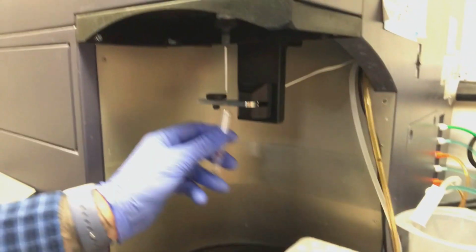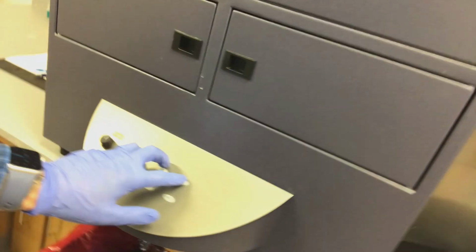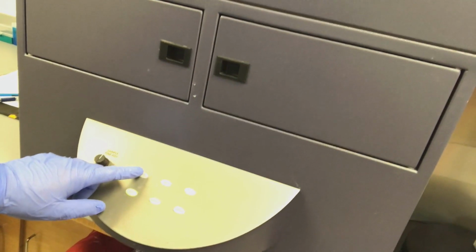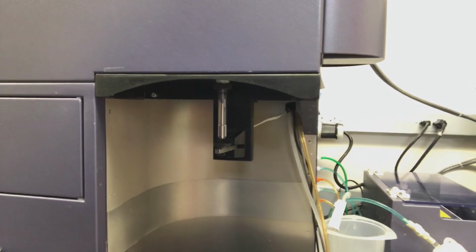Then, after we prime, we always load a tube of water, center the arm, and run on high to stabilize the fluidics. Once that's done, switch it back to low or medium, and then you're ready to start running your samples again.